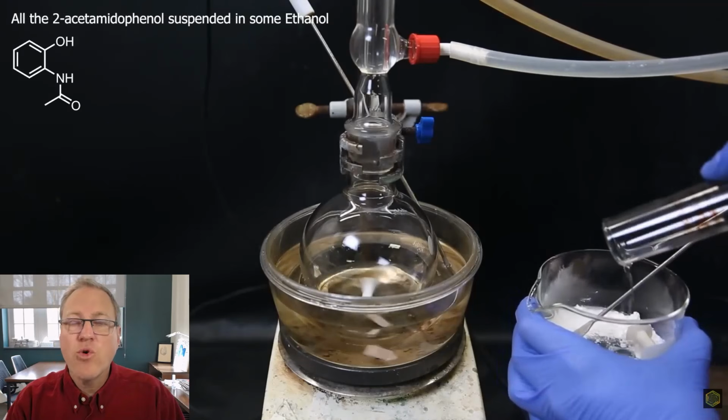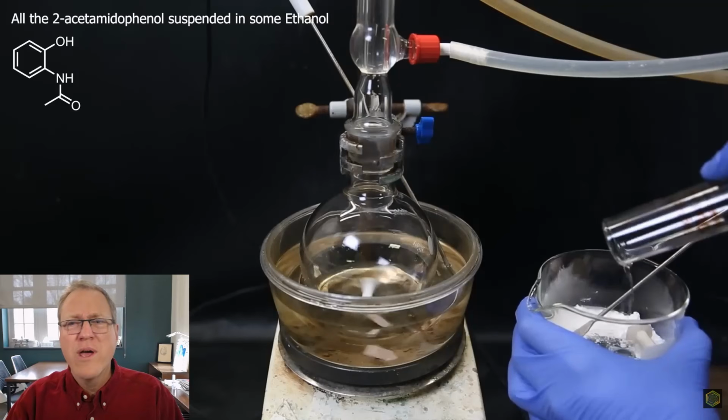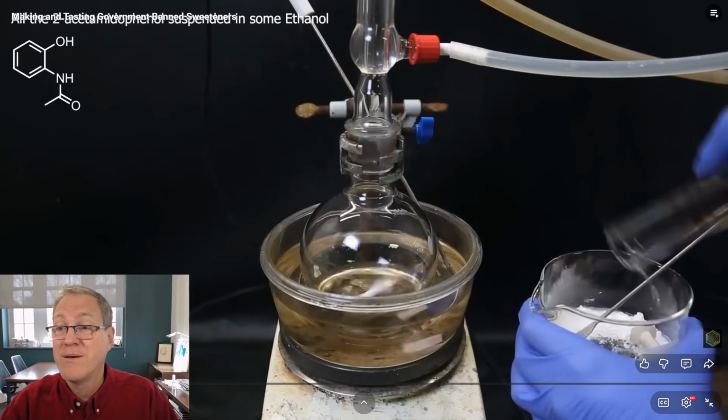Okay, I want you to watch him pour this into the flask. He has that solid. He's going to swirl it around to get a suspension of that solid, and he's going to pour it in his flask. And he does a beautiful job of this pour. He's going to get it all in the flask. He's not going to get it all around the sides of the neck of the flask, which is what I would do. It's all going to go right in.